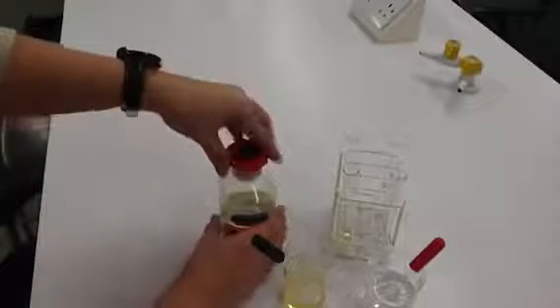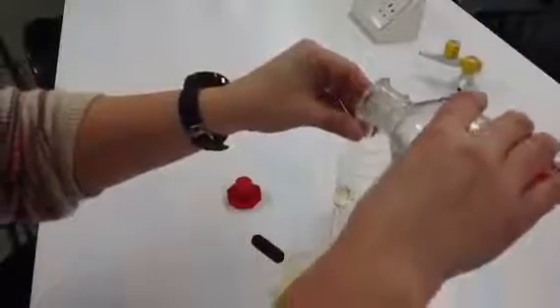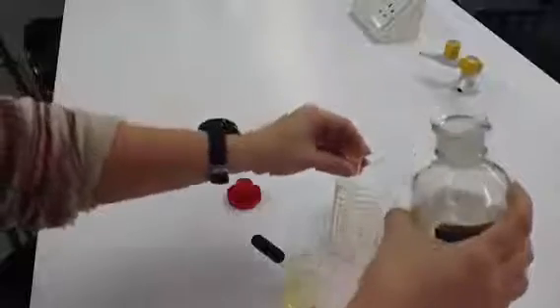Now, lipids don't dissolve in water, so we need to use an alcohol. So in this case, we're using ethanol to dissolve our lipids in the first part of this experiment. Now, we add the ethanol to both samples, and then we need to shake the samples vigorously to dissolve those lipids. So thumb over the top and shake vigorously. Okay, so we do that with both samples.